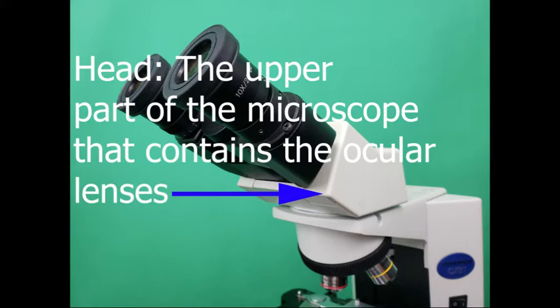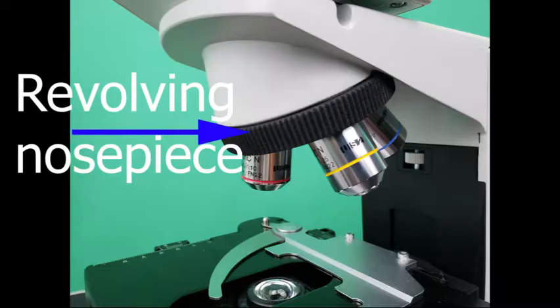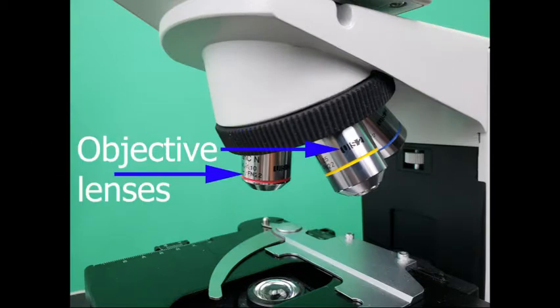Head: the upper part of the microscope that contains the lens and includes the ocular lens, revolving nosepiece, and objective lens.